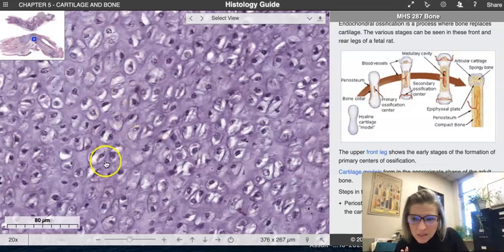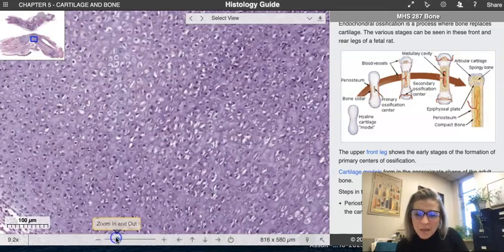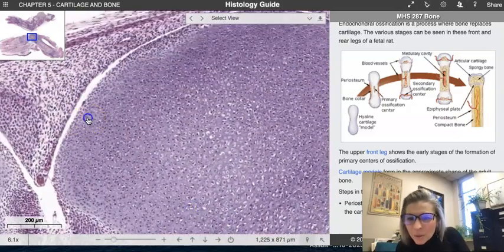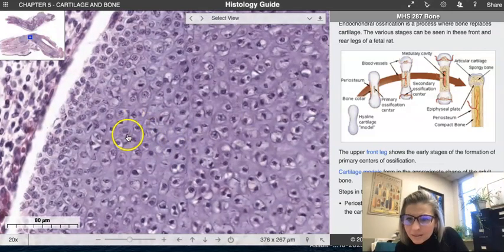And so in some of the cells you might be able to see a nucleus, some you might not. Maybe it's just a uniform cell. So here's the cell, a membrane around the outside. It does have a nucleus, whether we see it or not, and cytoplasm filling the cell, the whole nine yards. And then the space around would be essentially the lacunae. If I go back out to a little bit lower mag here, and I go to the surface, we might be able to see, oh, not really. Most of these are actually cytes.